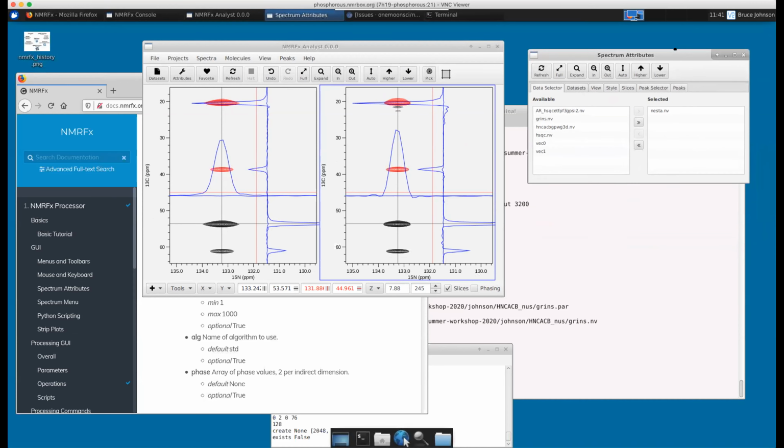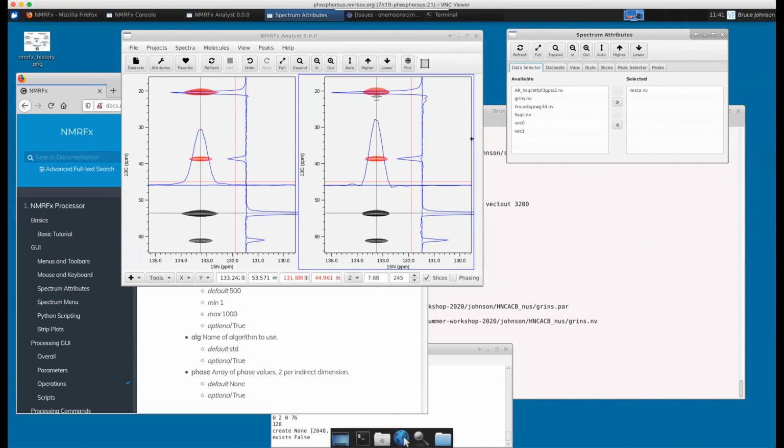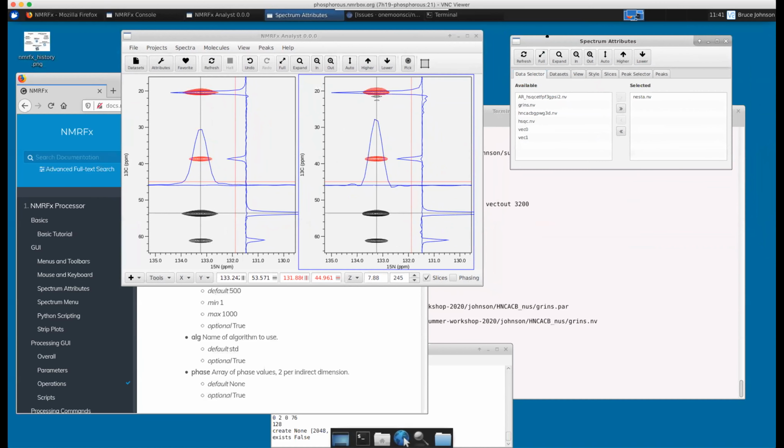And I make no claims by any stretch, because I would say that we have not won the NUS. We only competed once, not won. So I can't say that our algorithms are the best, but they're useful, fast, and easy to compare, and we keep looking at them.